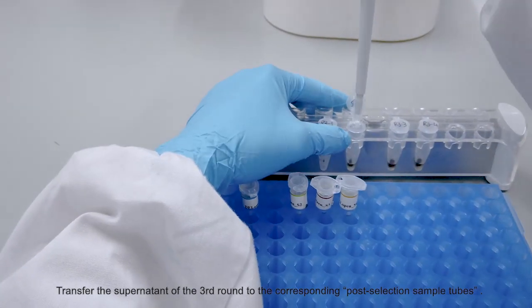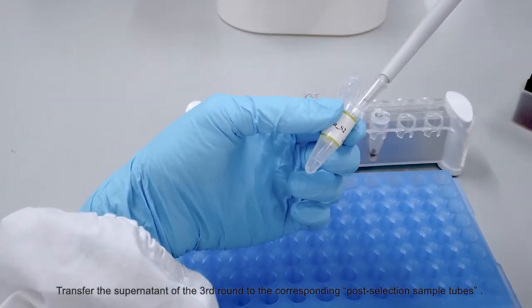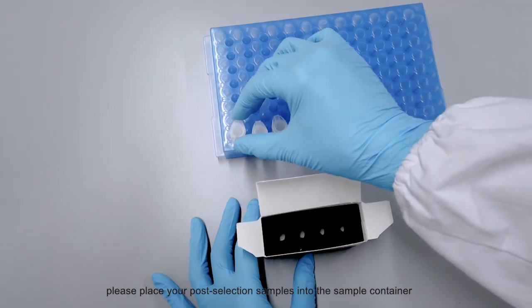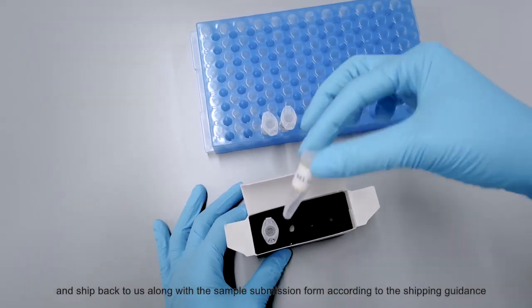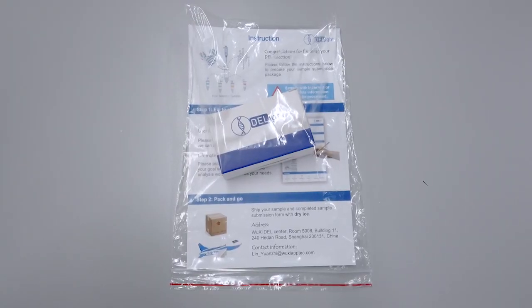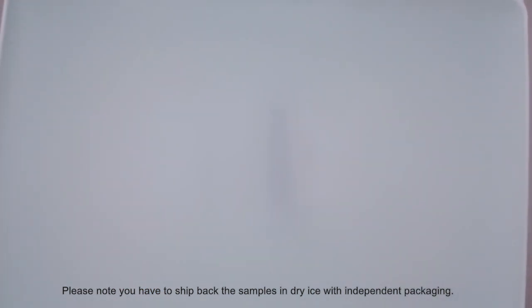Transfer the supernatant of the 3rd round to the corresponding post-selection sample tubes. Please place your post-selection samples into the sample container and ship back to us along with the sample submission form according to the shipping guideline. Please note, you have to ship back the samples in dry ice with independent packaging.